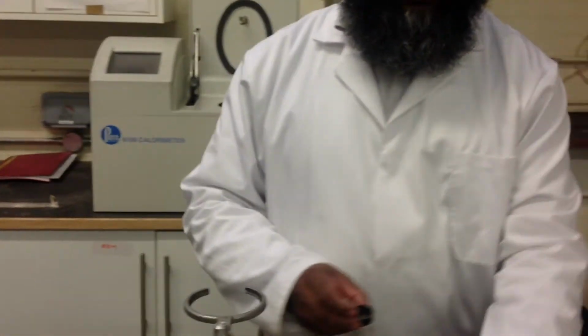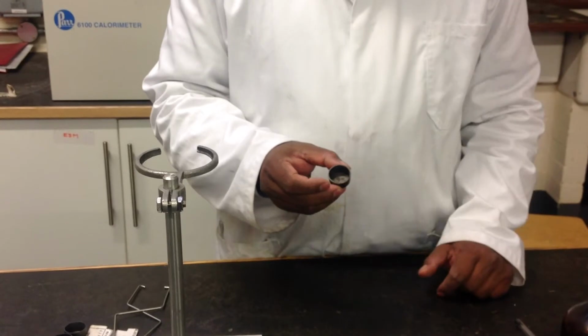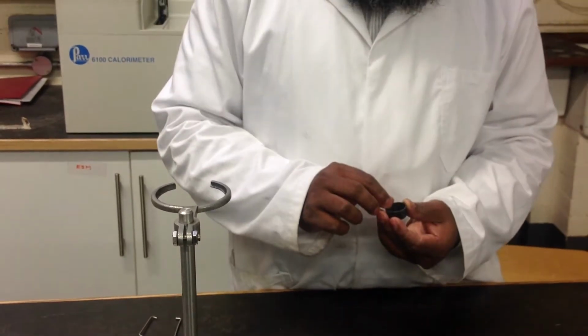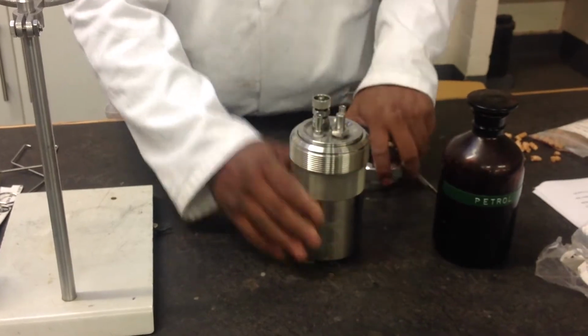So what we do is take some fuel sample into this small container known as a crucible. We take a little bit of sample, and then we measure the weight of that sample. This is the main vessel where the combustion takes place.